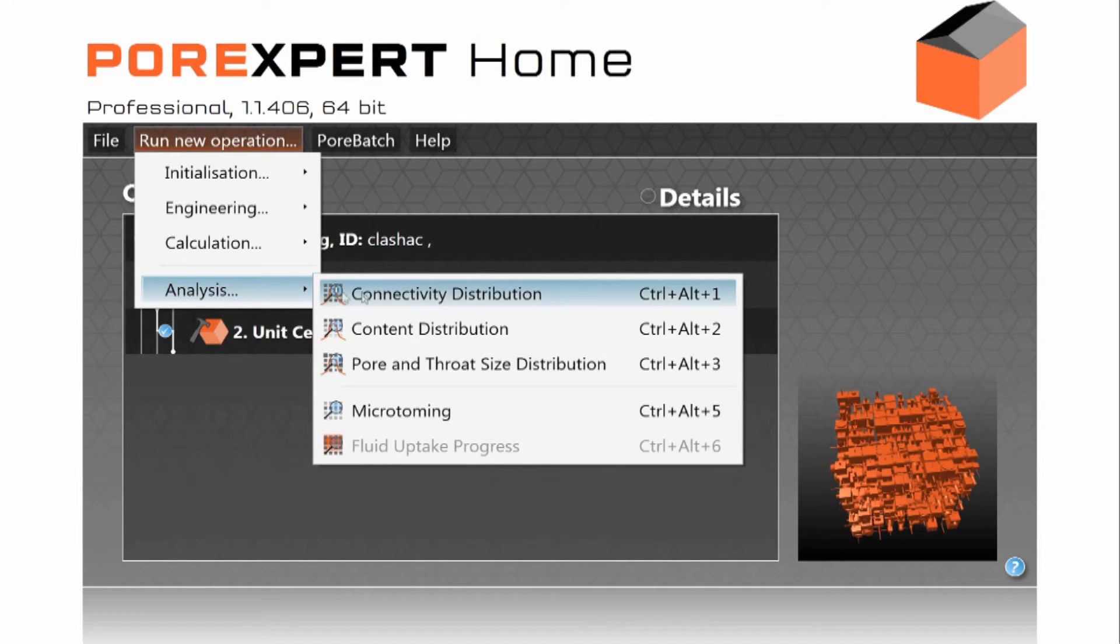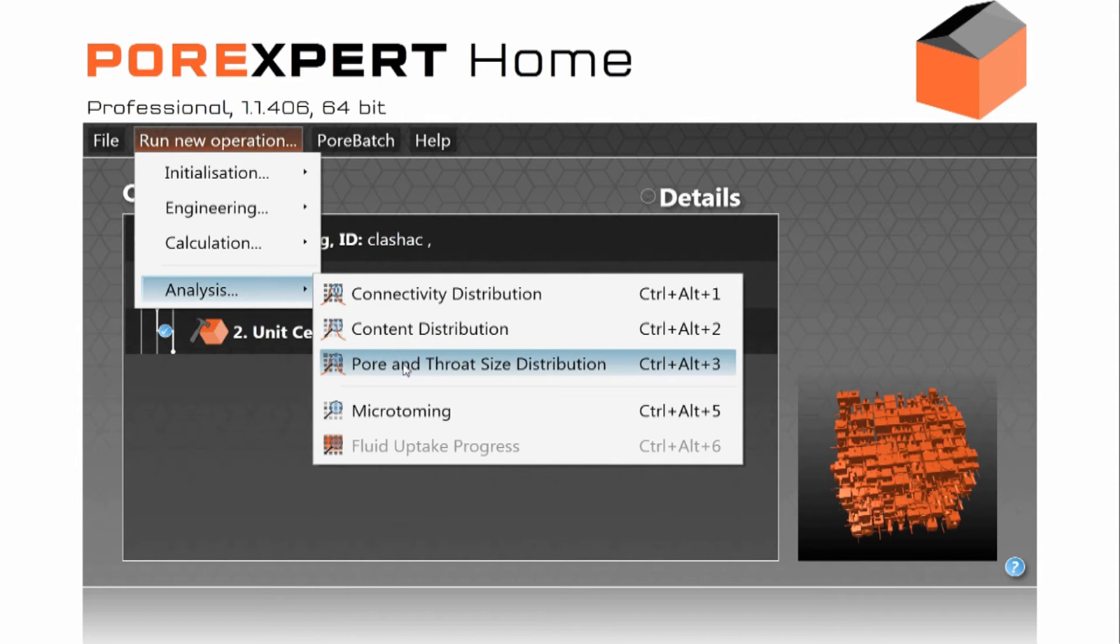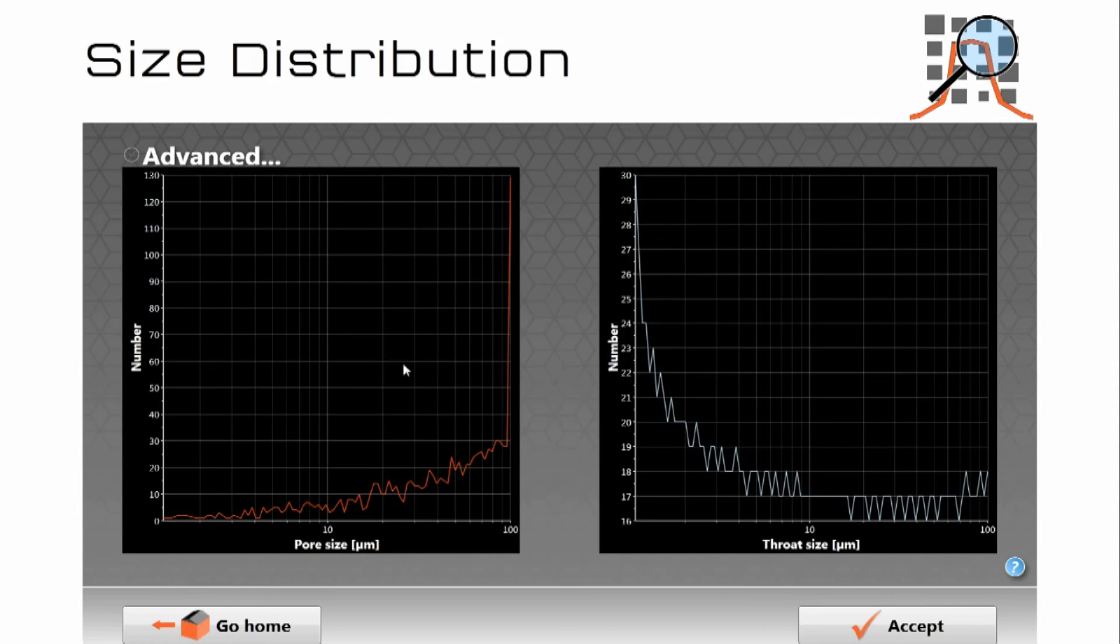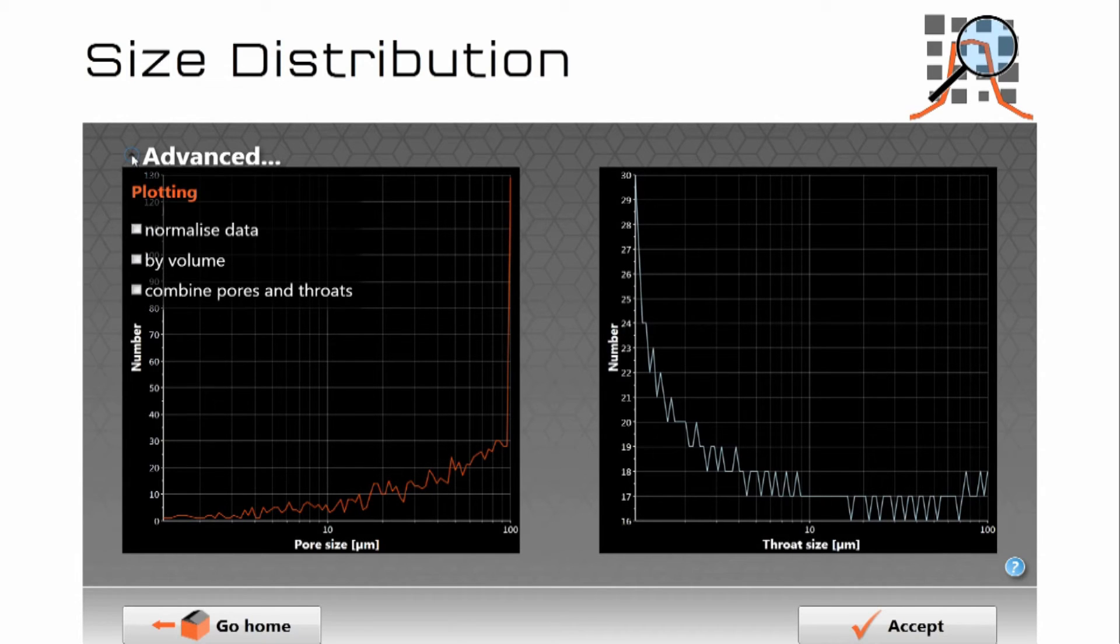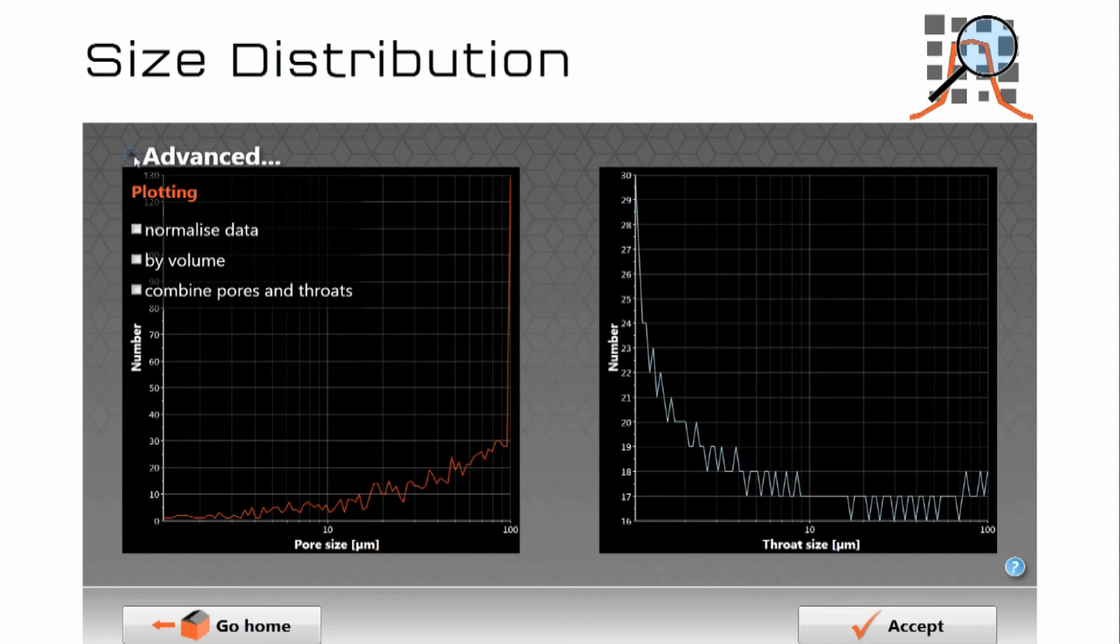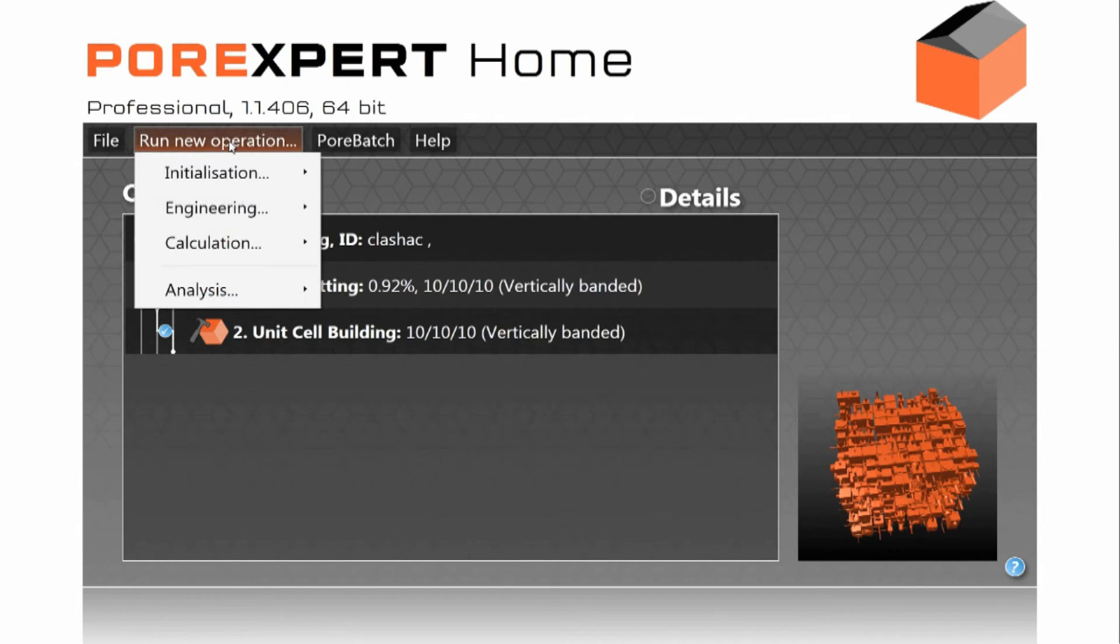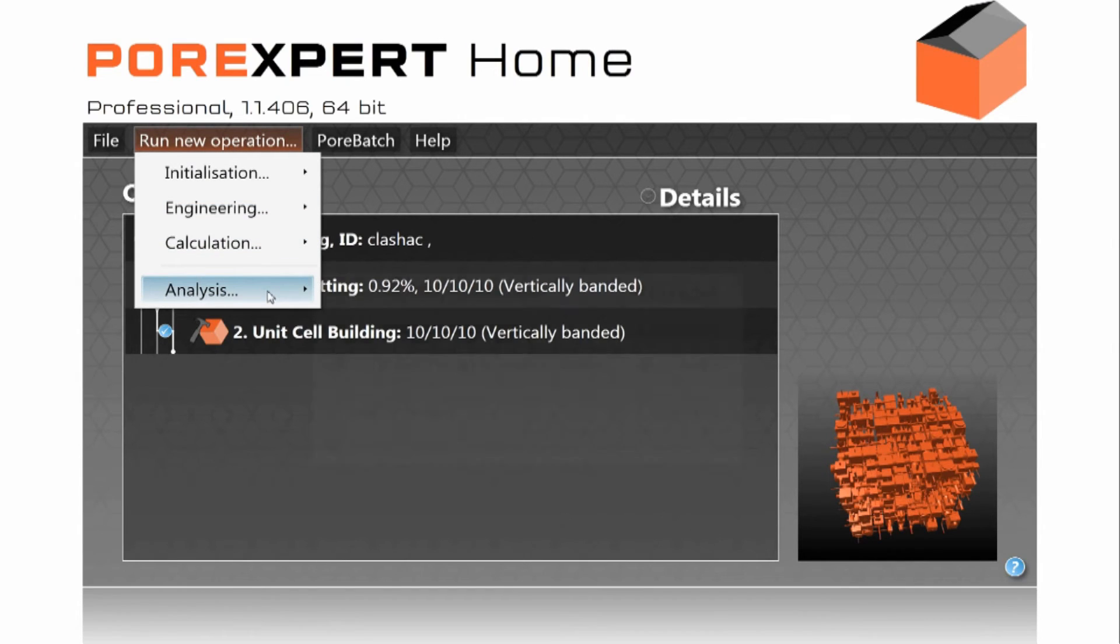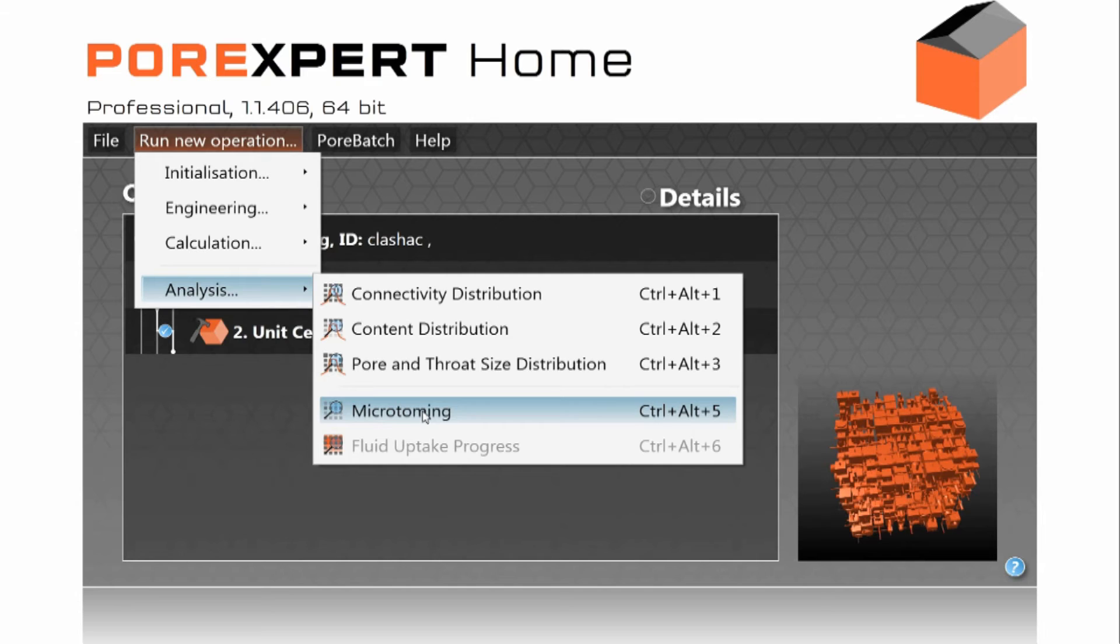We can look at the distribution of connectivities within the network, the content within there if we put fluids into it, pore and throat size distribution for example. Here are the sizes of all the features there which you can plot in other ways by volume. You can combine pores and throats together for example. And we can also for example simulate microtoming so you can compare it with microscopic thin sections.